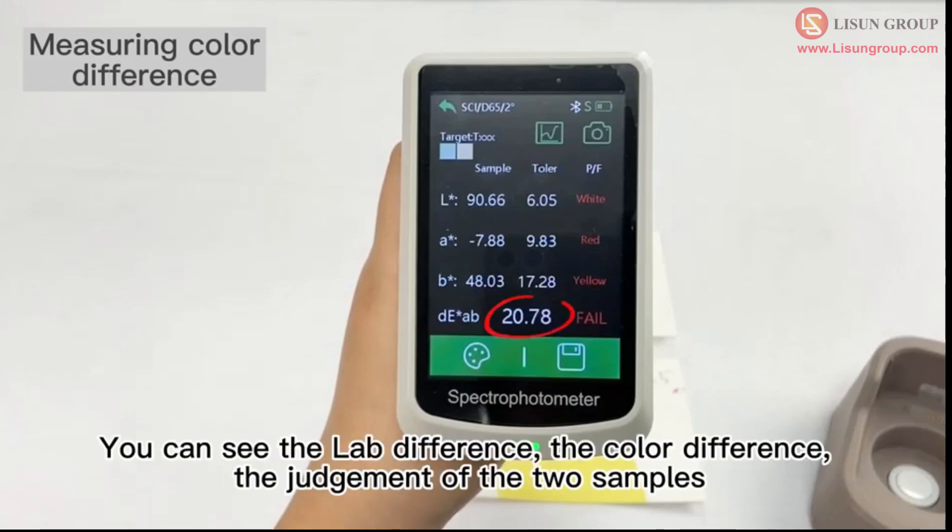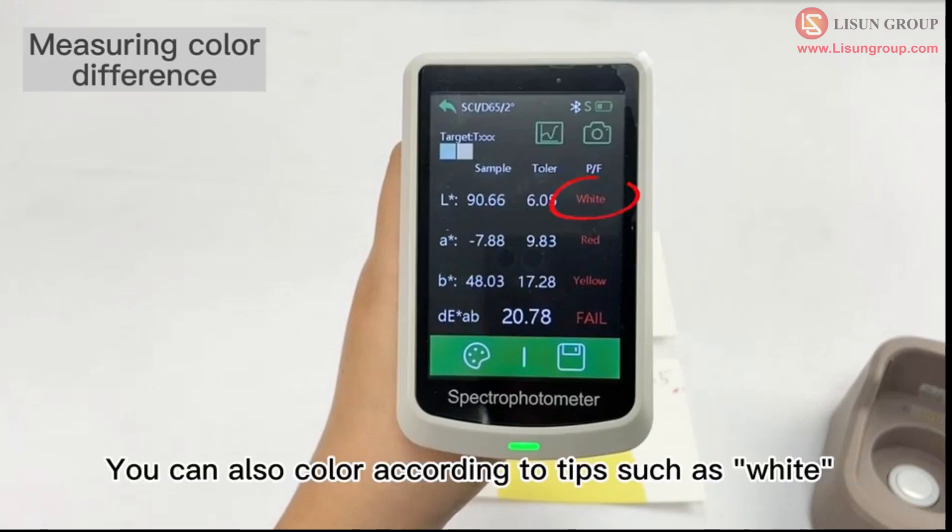You can see the LAB difference, the color difference, and the judgment of the two samples. You can also apply color according to tips such as white.